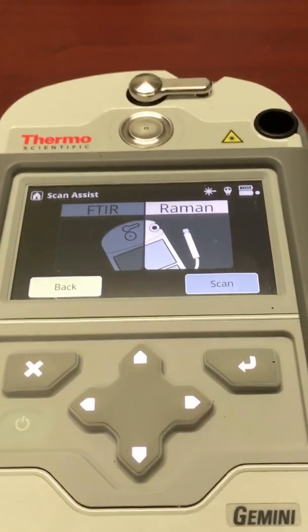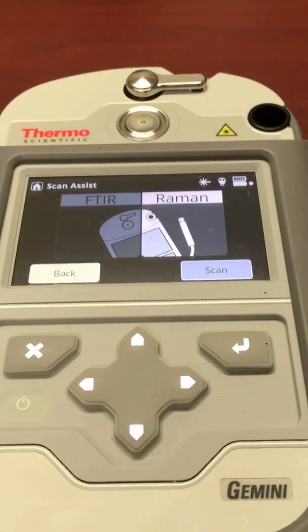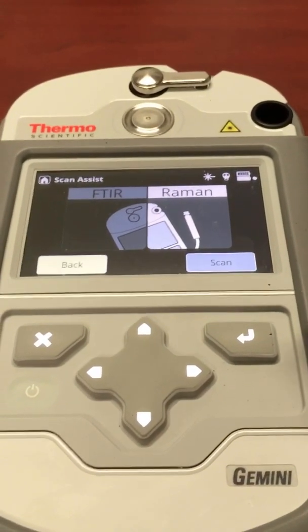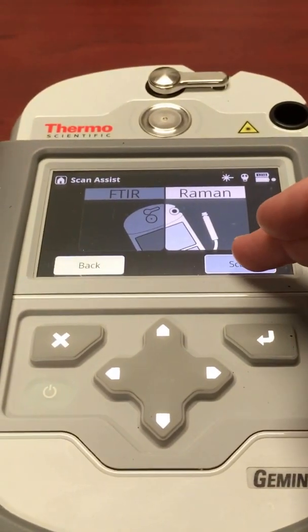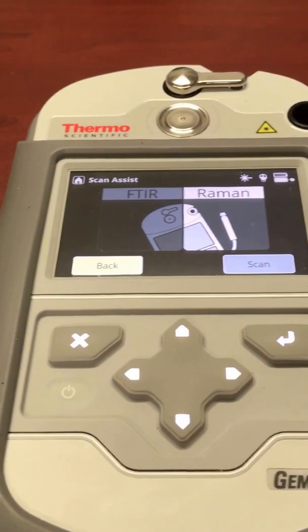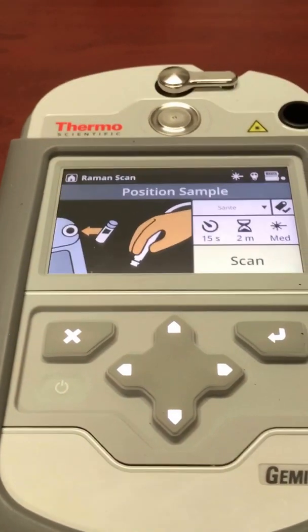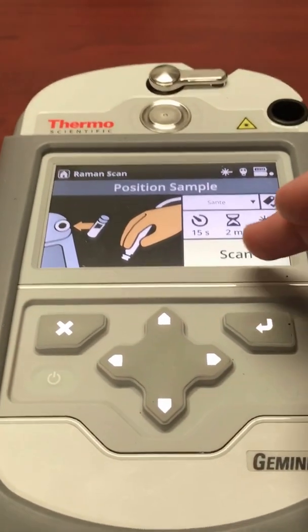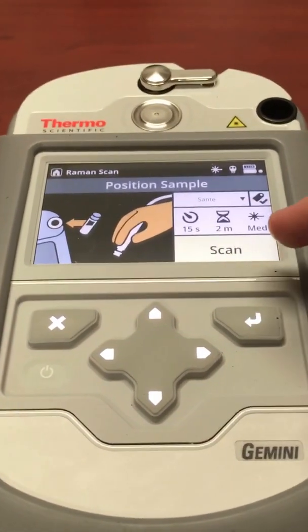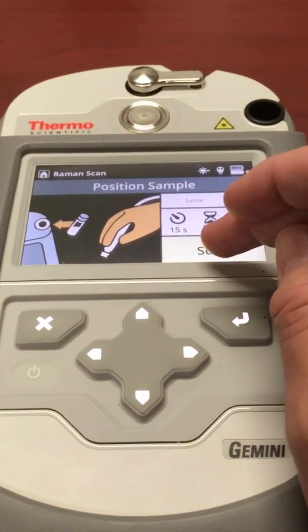Based on those answers, it's recommending Raman, which uses the laser. We hit scan, and then hit scan again to initiate.